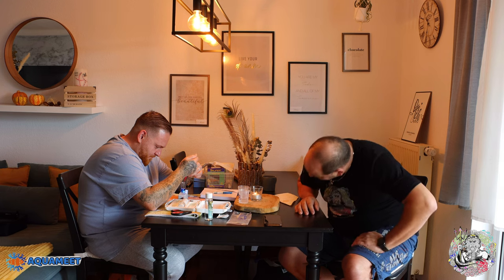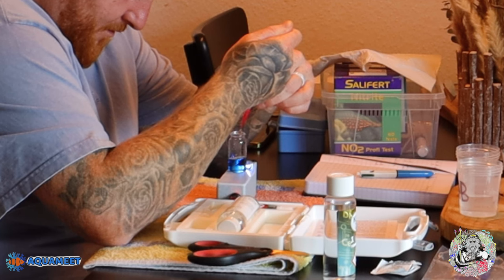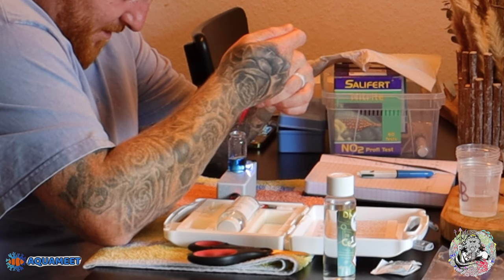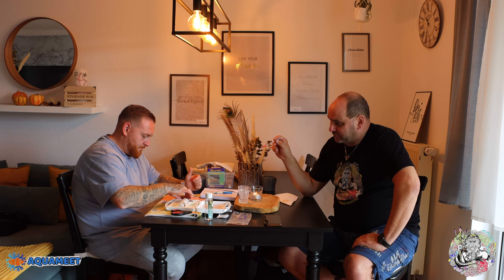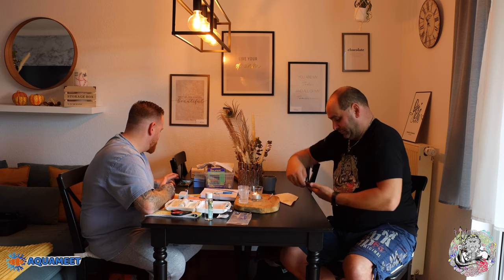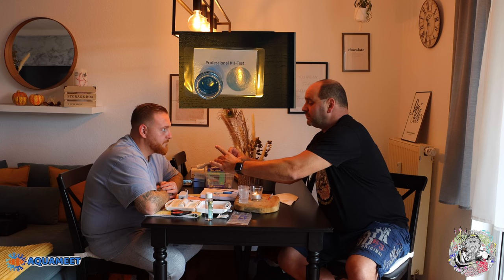Langsam dürfte er kommen – jetzt zwei, drei Tropfen machen. Einer noch. Er fängt an umzuschlagen, ist aber noch nicht auf der Farbe. Jetzt kommt es langsam – Stopp, jetzt haben wir die Farbe. Was auch ganz cool ist an dem Gerät hier, dass das Licht mit drin ist – das finde ich äußerst gut, es gibt einige Geräte wo das nicht der Fall ist. Jetzt checken wir es einmal gegen und das passt. Es ist tatsächlich eine intensivere Färbung. Wo sind wir? Bei 2,7. Der geht bei 2,8 das ist 7,2 und 2,6 sind 7,4.